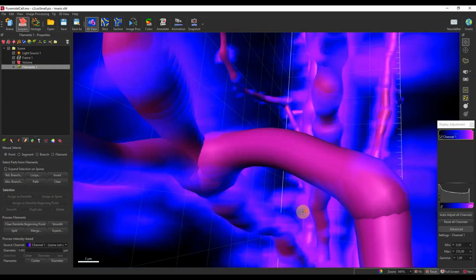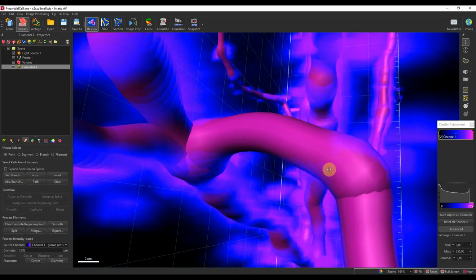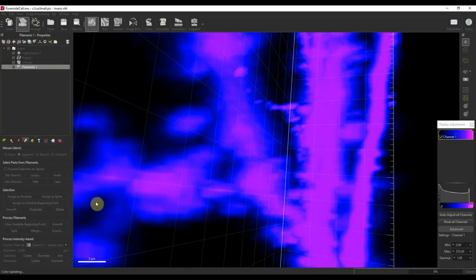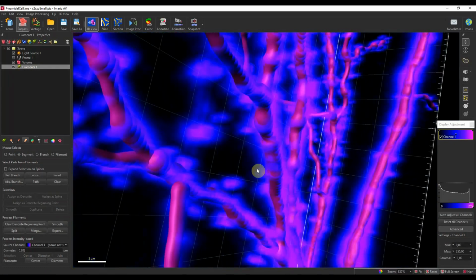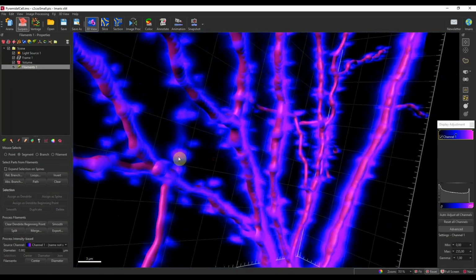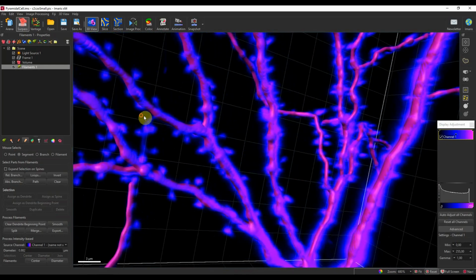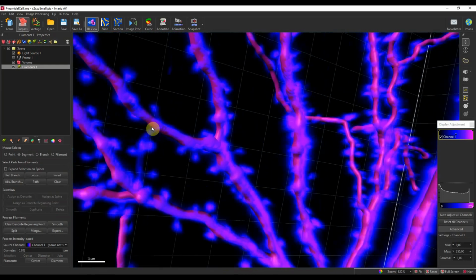And as you can see here, we have created this segment here that has been disjoined from the rest of the filament. And now, just like before, quite simple, I select for that segment and I delete it. The last step would be to connect this filament that we have created with its correct branching point.